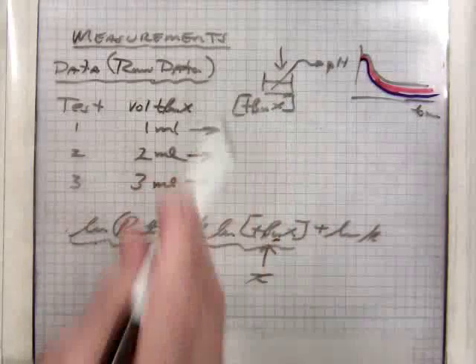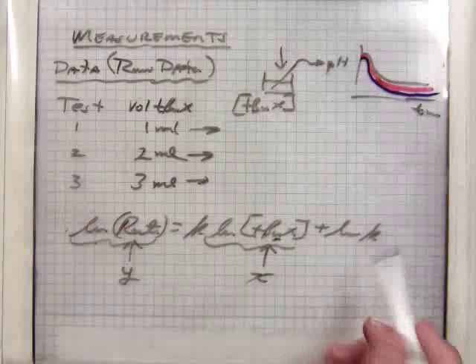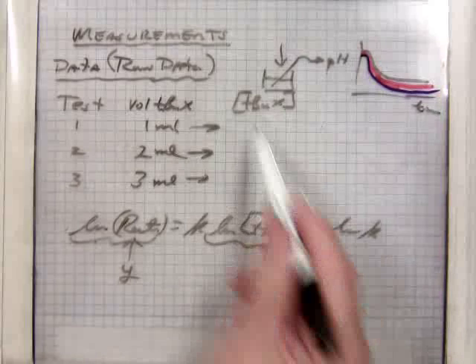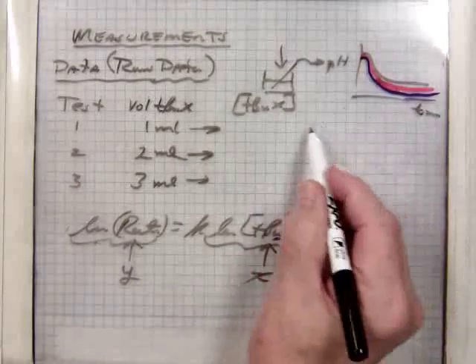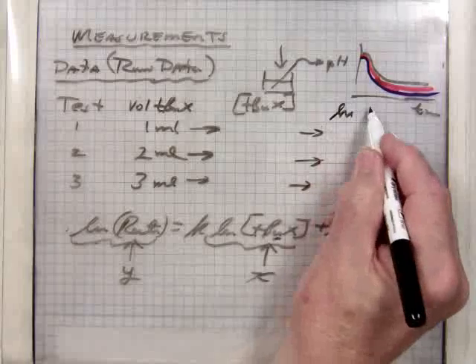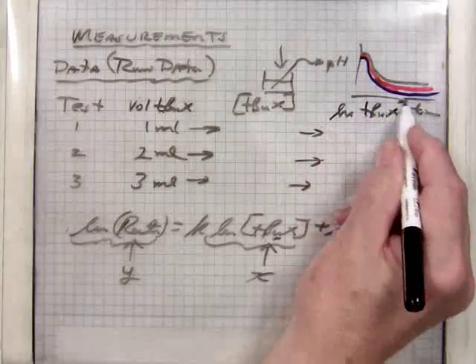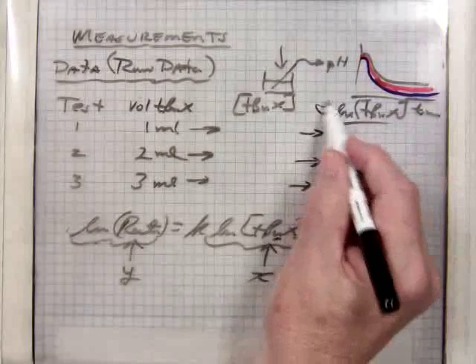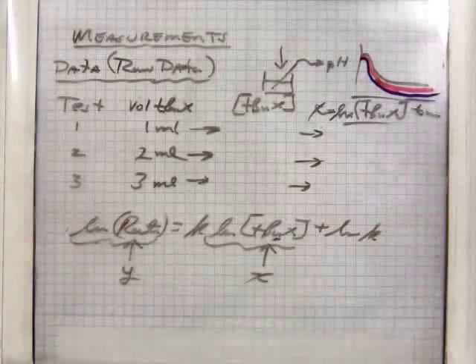I'll be there to show you. It's on the worksheet. I'll show it to you in a minute. Okay, so what you have is these three, and then from that, once you get those concentrations, then you'll have an ln of T-butyl halide. Those three numbers are actually your X values that you'll plot.